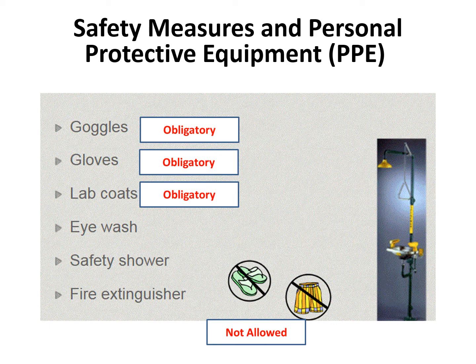In terms of clothing, like I said, no open-toe shoes, no canvas shoes, no shorts. Your pants must go all the way down to your shoes, and no workout clothes, yoga pants, anything like those. Those are incredibly thin materials and very permeable to liquids, and we've had multiple issues with chemical burns just from a couple drops that seep through the clothing very quickly.